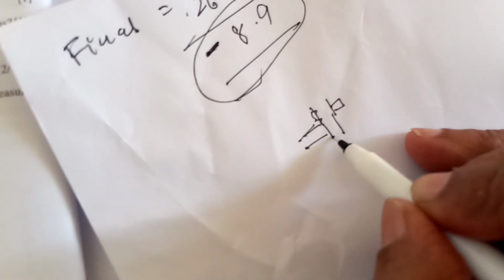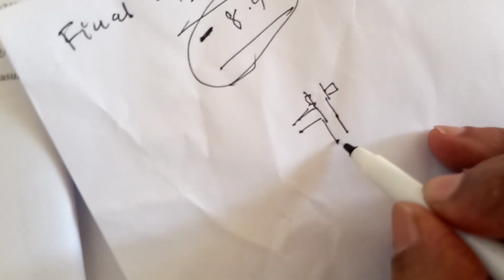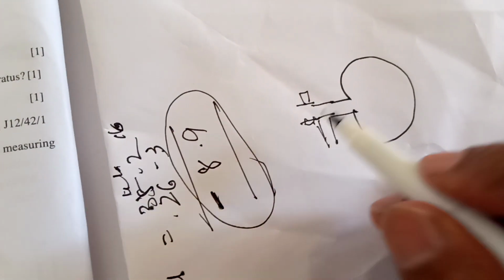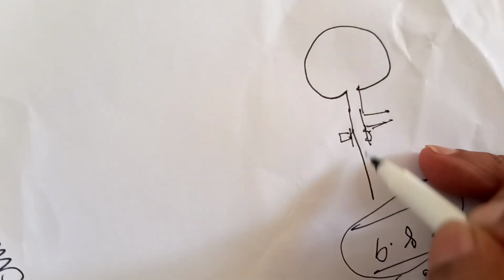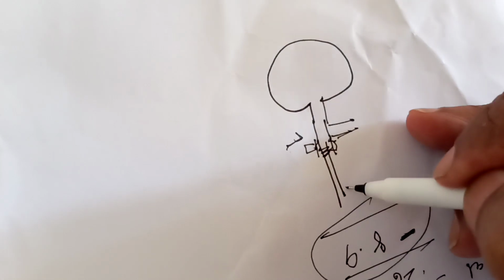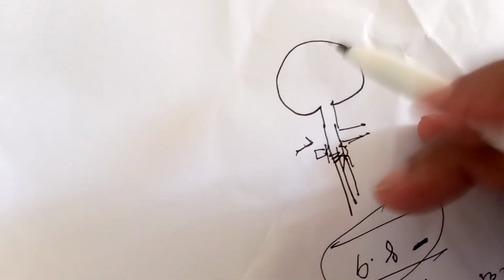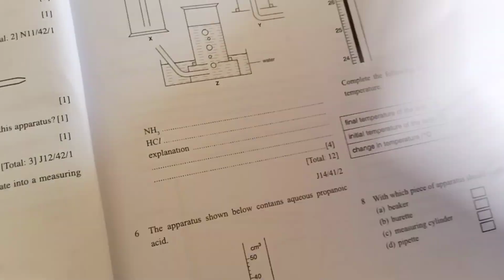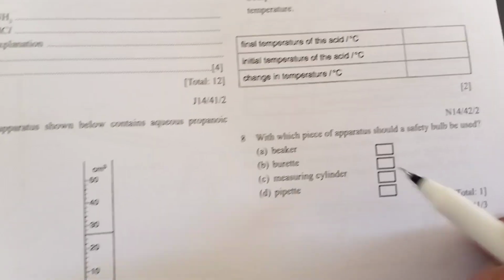Here we put the pipette. Then we press this one and then press the bulb. It will suck the fluid. Then we press this one, the fluid will move out. Okay. This you know.